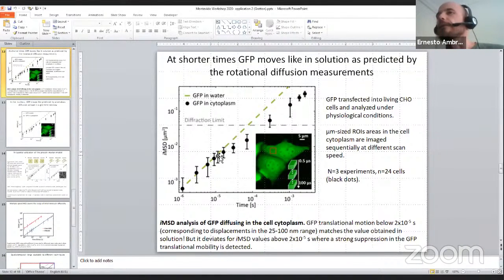Yeah, and having that, is it homogeneous all around the cell? No, not really. I mean, not saying within the nucleus, but within the cytosol. No, it's not, because if you get the mitochondria, they are much.